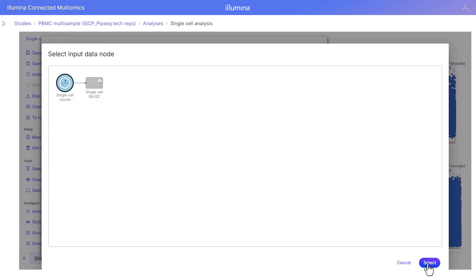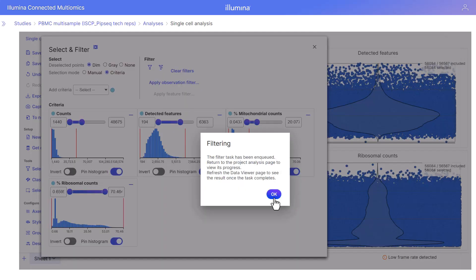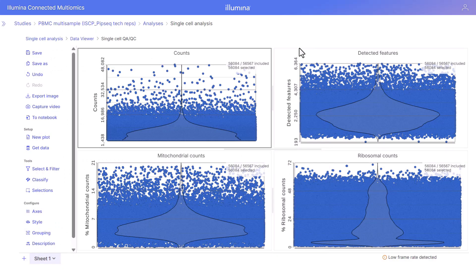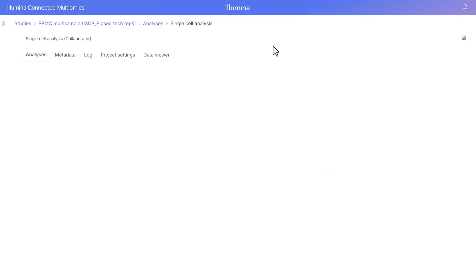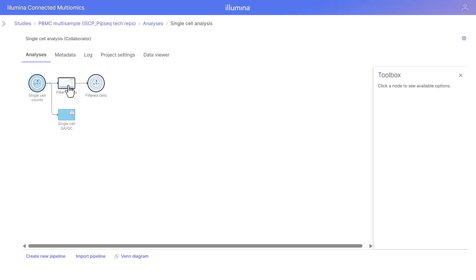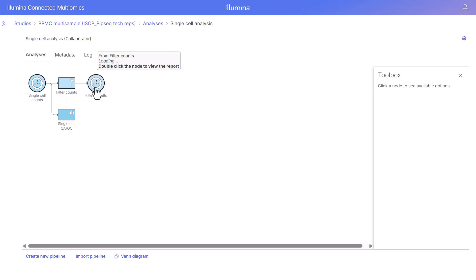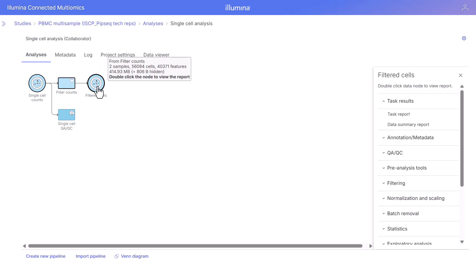We can apply this observation filter to the single cell counts node and select that node. This task has been queued on the pipeline. We can go to our pipeline to see this task queued by clicking on the name of the project. The filter counts task is queued, and when it completes it will turn from transparent to opaque. Our cells have now been filtered, and we see that reflected here in the result node.